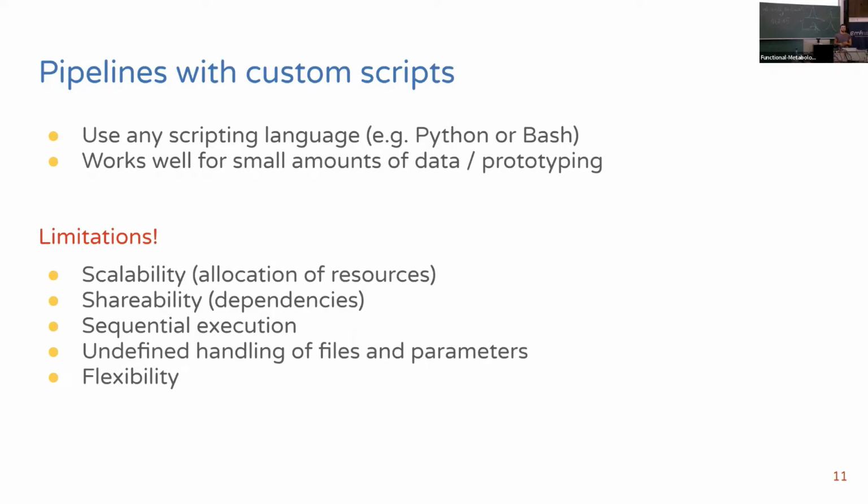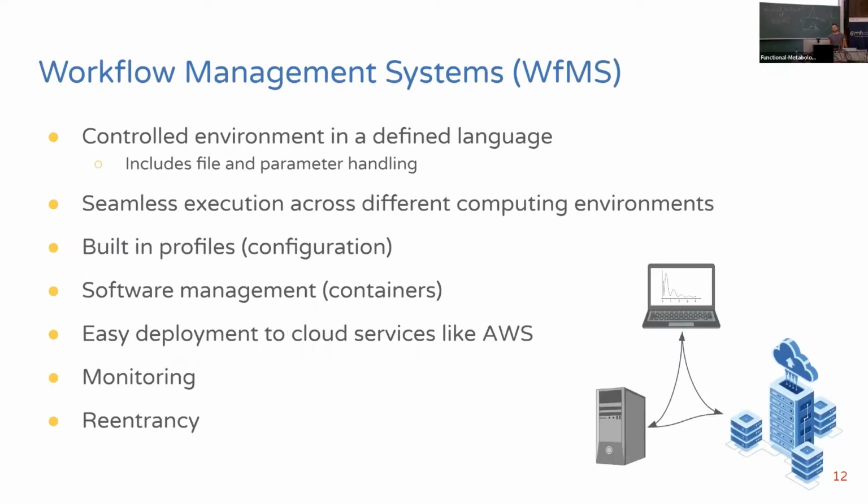And of course, if you have written your custom scripts, you might be the expert for that. But when another person uses it, it might be difficult to get into the style of coding and how the individual handles the files, file names, directories, and also parameters. And another thing is flexibility. Even if you have a script that works very well for you and your special application, it might not be very flexible to adapt to other options or to include steps in your workflow. And that's where workflow management systems come into play.